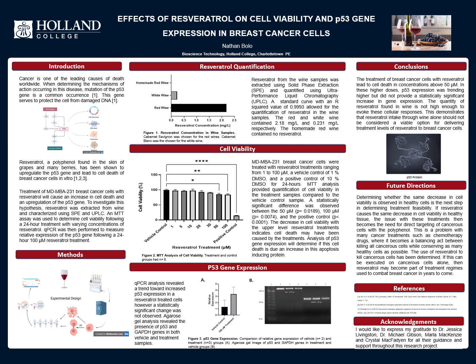To investigate these questions, three objectives were examined. First, SPE was used to extract resveratrol from the wine before it was quantified using UPLC. Second, breast cancer cells were grown and treated with resveratrol ranging from 1 to 100 micromolar concentrations. After 24 hours, cell viability was determined with an MTT assay. Finally, relative p53 gene expression was compared between the vehicle control of 1% DMSO and the 100 micromolar resveratrol treatment.